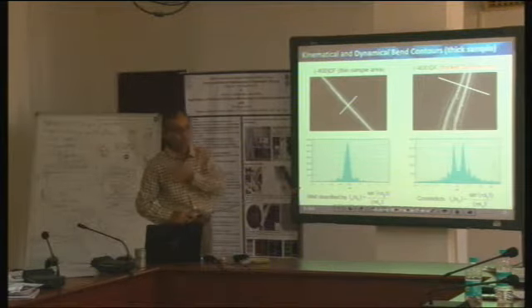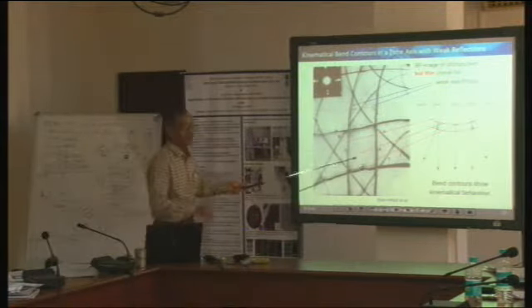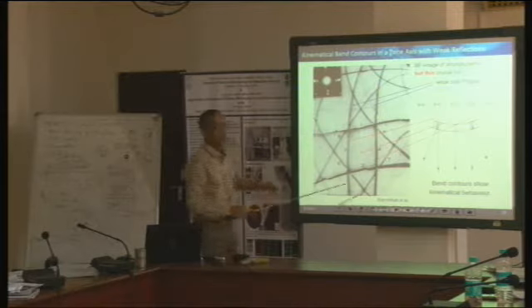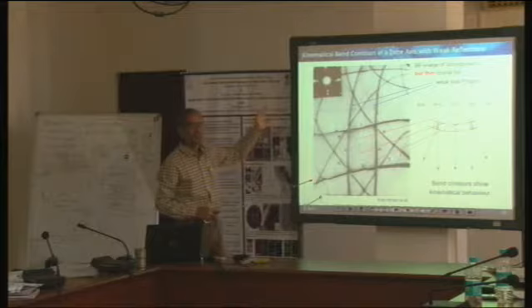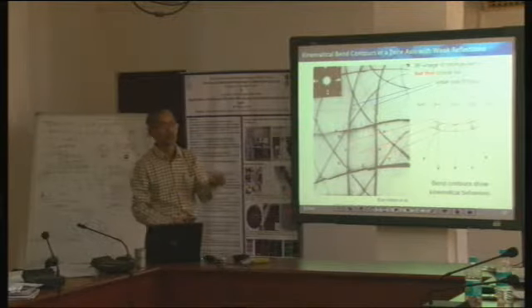When I have a parallel beam, a bright field image, it's all mixed up. You can't conclude that along this line it is this condition or that condition that is satisfied. So from that point of view, the dark field image is more informative.